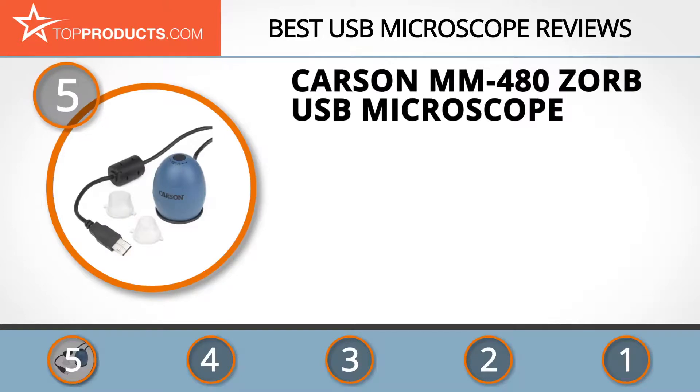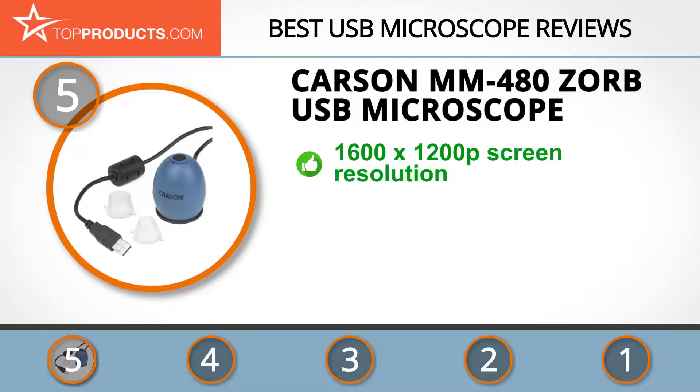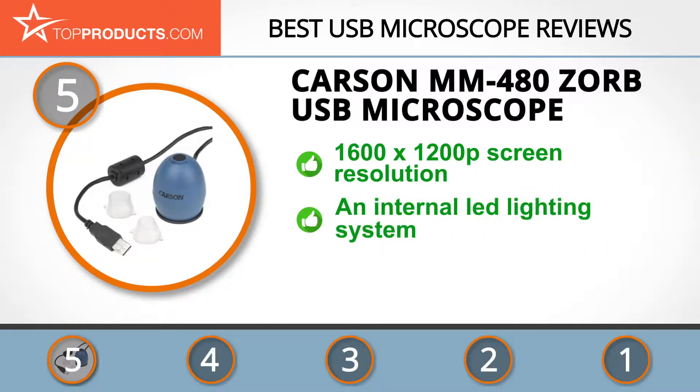At number five is the Carson MM480 Zorb USB microscope, chosen not only for its features but also because of its budget-friendly price tag. Carson is a tech company that utilizes a differentiation strategy to create unique and quality optical products. The Zorb digital USB microscope features a 1600 by 1200 resolution screen that allows you to view the fine details of your images.